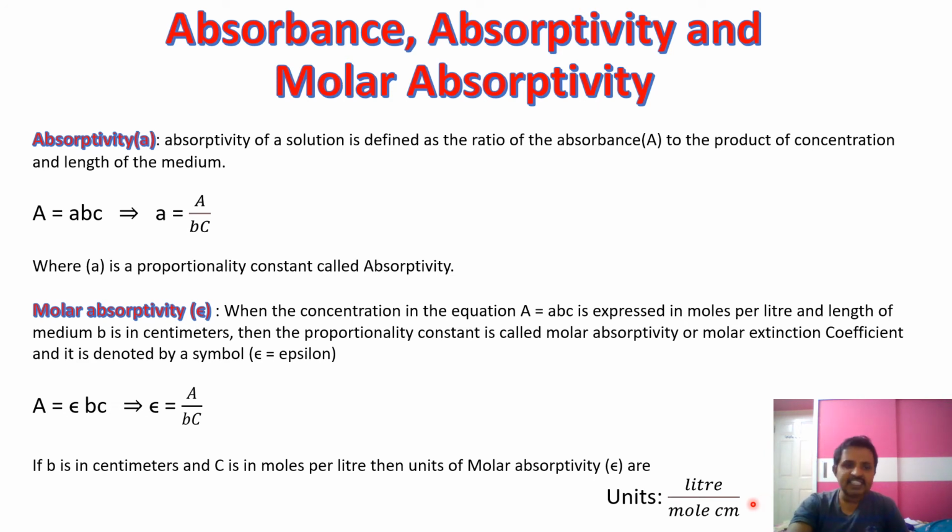Now, let us discuss the units of molar absorptivity. Here b, length of the medium, is in centimeters, and concentration is in moles per liter. Then the units of molar absorptivity become liters per mole per centimeter.